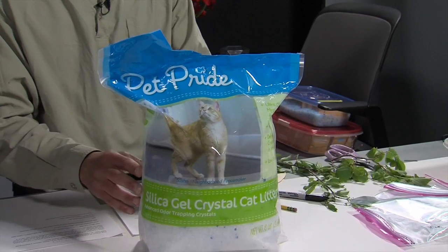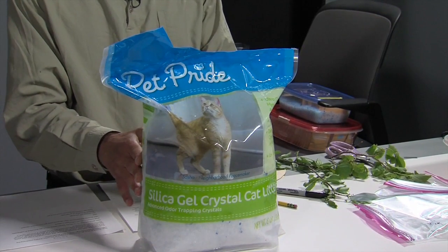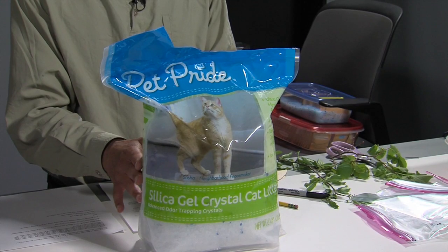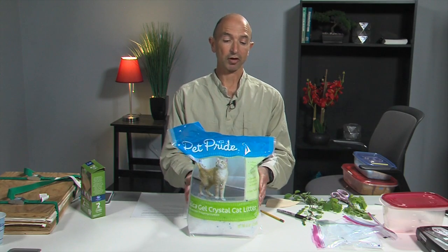Okay, what equipment do you need? You need something that can be used to dry the plant material. And the best thing for this is silica gel. You can buy lab-grade silica gel, but you can also buy something like kitty litter. There are many different types of kitty litter. Most of them are inappropriate. Make sure that it is silica gel, sometimes that's labeled silica sand, and make sure there are no other ingredients such as perfumes or activated charcoal, just silica gel.